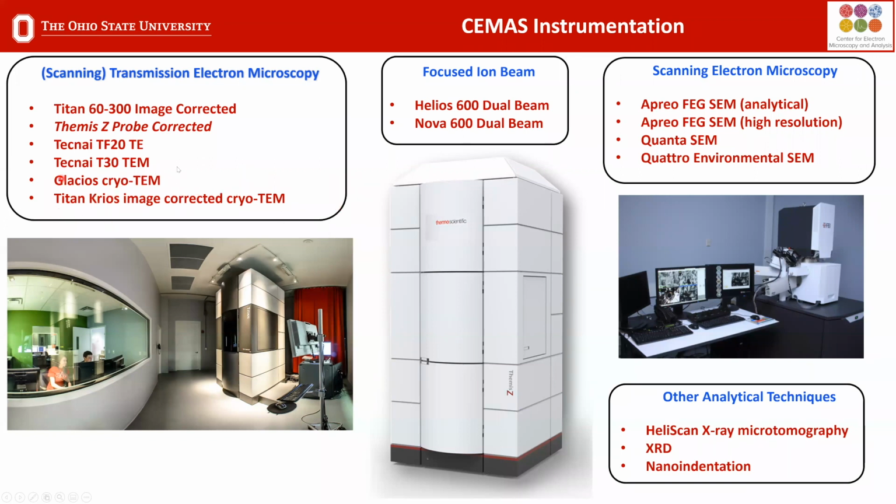We have 2 microscopes that are very good as a workhorse to train on and to teach and to do classical microscopy. And then we have 2 aberration-corrected microscopes. We have an image-corrected, and then we have the probe-corrected Themis-Z. The probe-corrected Themis-Z arrived just a few weeks before the quarantine set in. So we have some preliminary data, but what I want to talk to you about is what the potential will be when we open back up and what's at our fingertips to really start to explore.